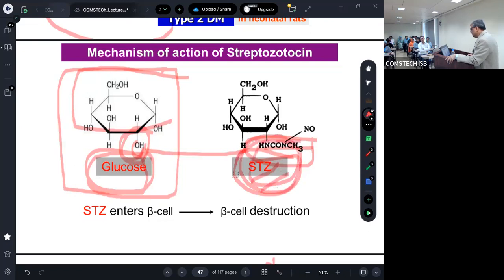Yes, student, anyone tell me, how is citrate buffer normally made? Citrate buffer, okay? Citrate buffer pH 4.5.